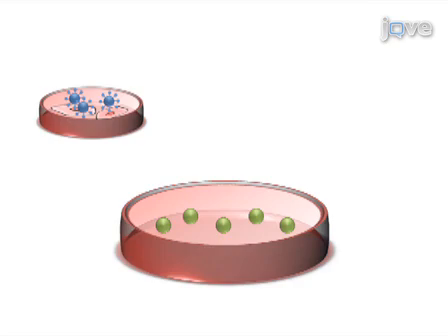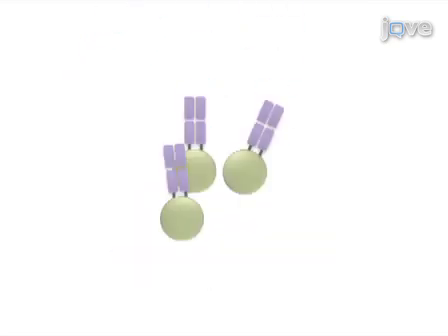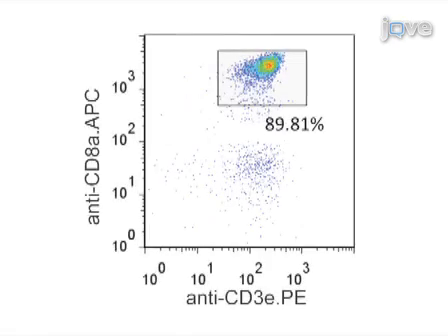Infect these purified T-cells with the retrovirus produced in the first step. Finally, expand the transduced T-cells to express and obtain appreciable levels of receptor. Ultimately, results can be obtained that show the expression of functional antigen-specific TCRs on mouse T-cells through flow cytometry.